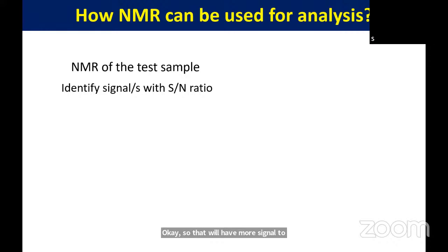But the COOH signal, if it is there, carboxylic acid, that hydrogen is constantly undergoing hydrogen bonding interactions. So it cannot show 100% presence in the NMR, proton NMR spectrum. It is a very complicated situation. So those protons cannot show very strong signal to noise ratio.